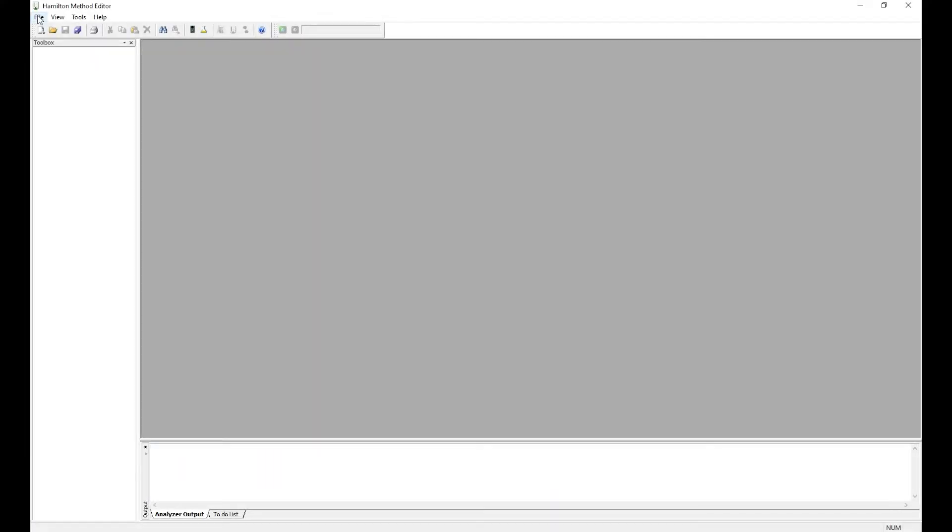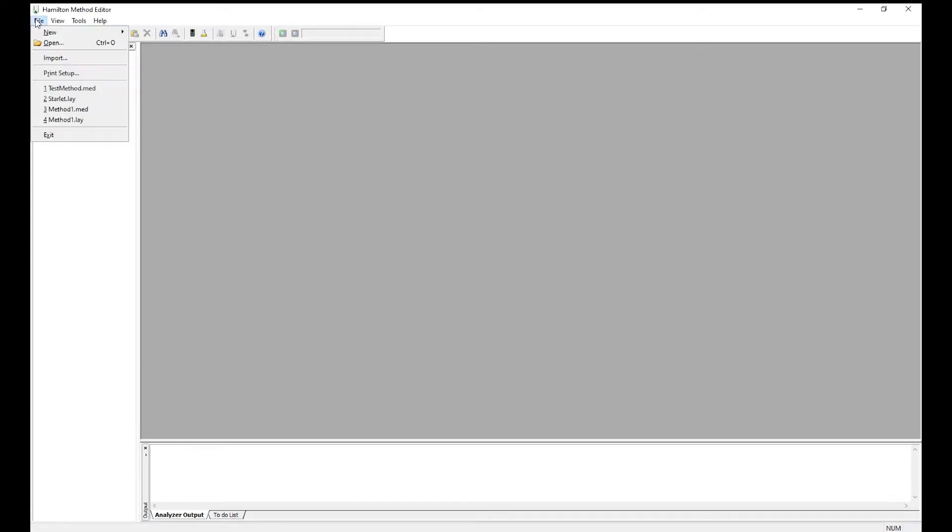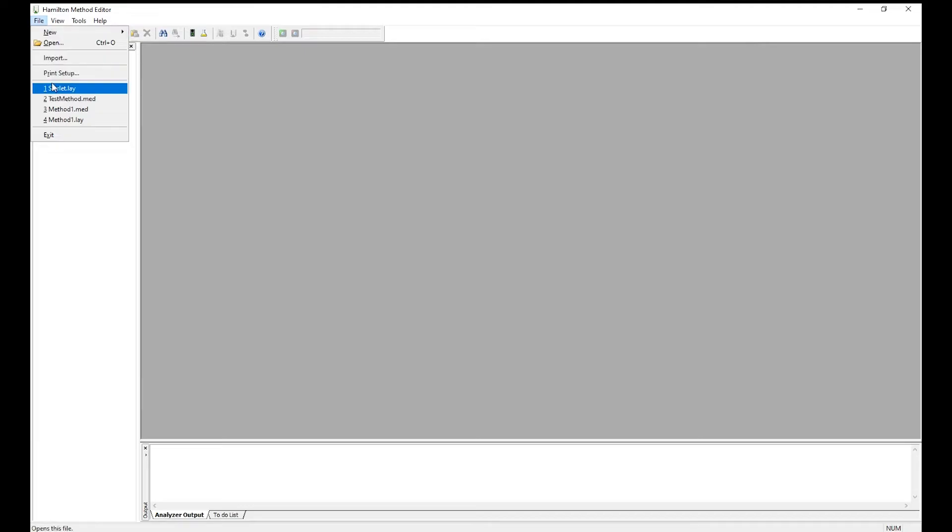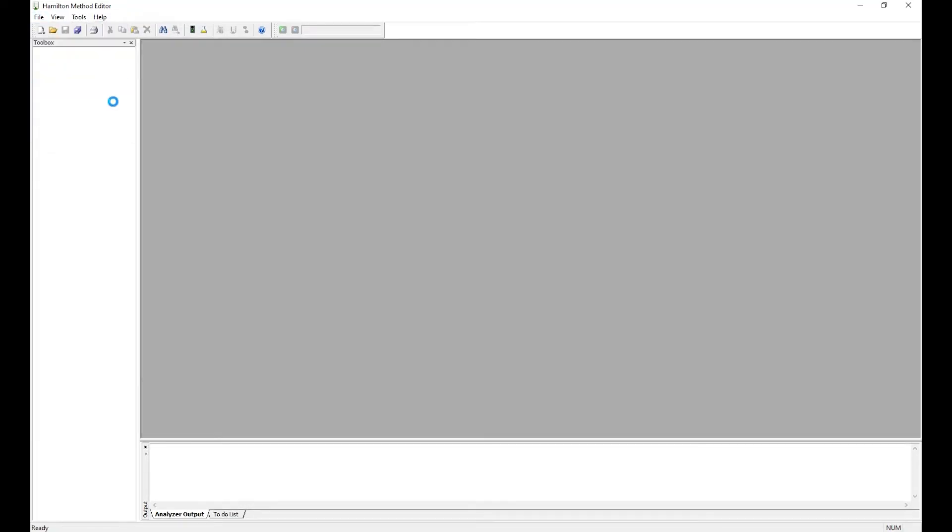If this is the first time using the Hamilton Method Editor, you'll need to set up a deck. Go to File, New, System Deck to set up your system deck layout. For today we're going to use an existing system deck layout called Starlet.